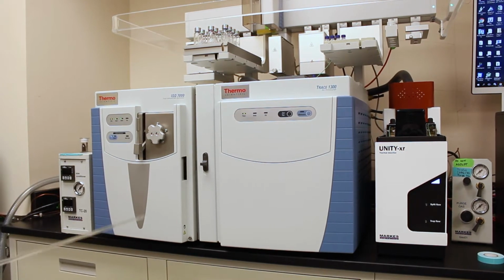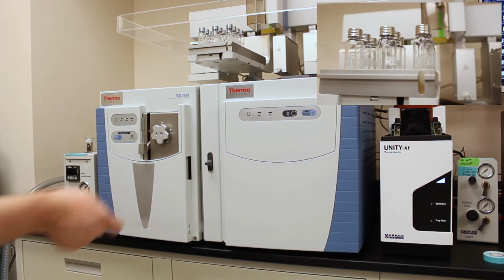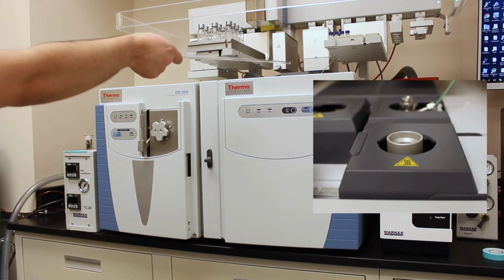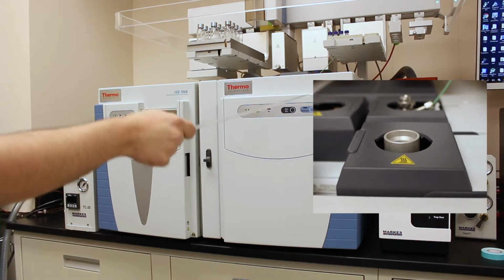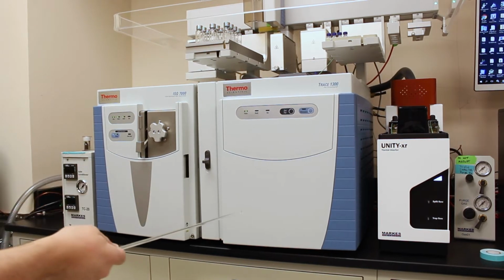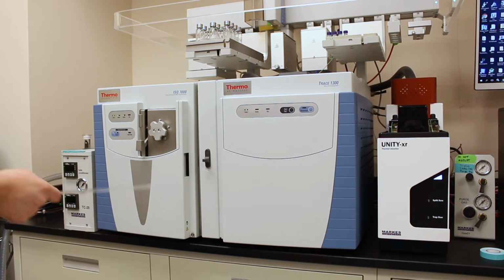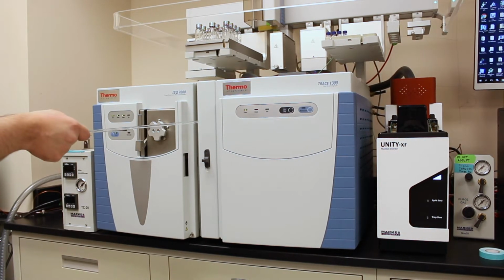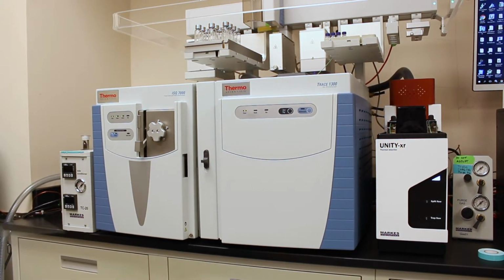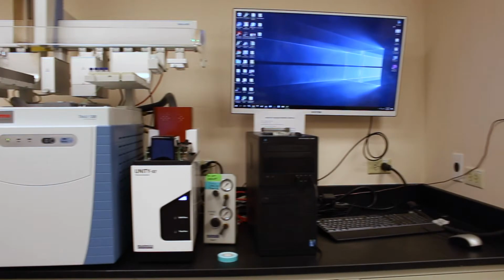So the way this instrument works is you take your molecule that you want to take the mass spec of, or a mixture. That's the beauty of a gas chromatograph. You can separate mixtures. You take that mixture, and then you inject it here in the injector, and then that mixture will be separated in the gas chromatograph. So chromatography is for the separation of molecules. After the molecules are separated, they're going to enter the mass spec. There's a little bridge here where it goes from the end of the column into the mass spec. First it will ionize the molecules, measure the mass to charge ratio, and then plot that data in a spectrum. And then that spectrum is generated on the computer to the right.